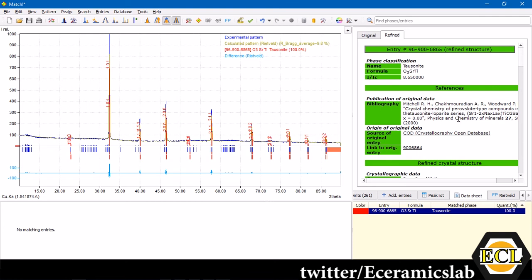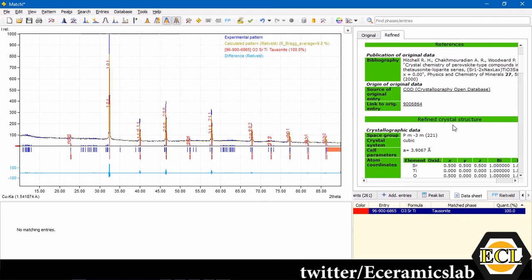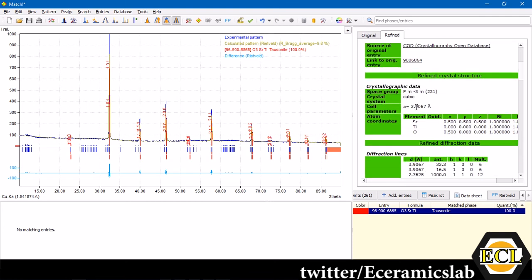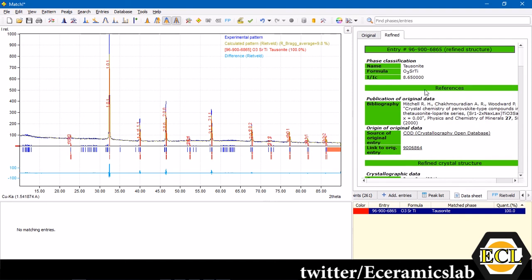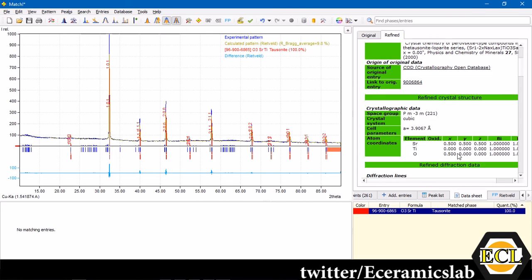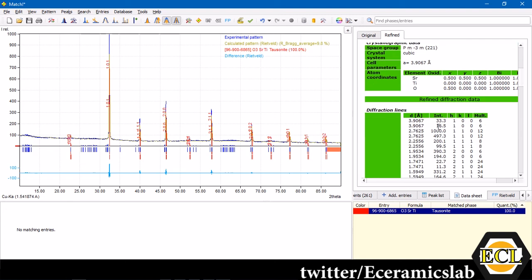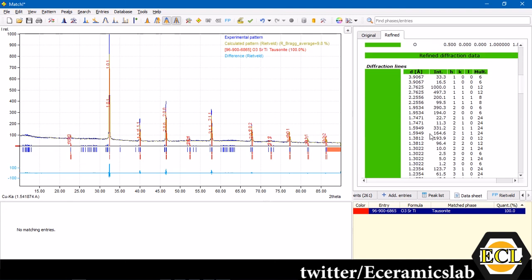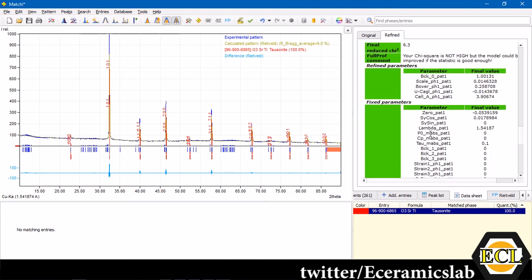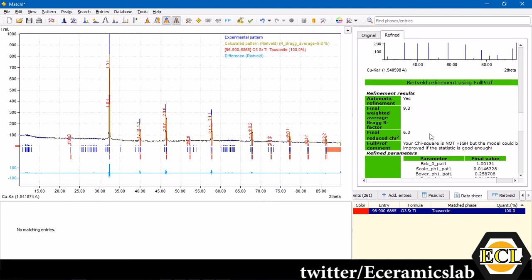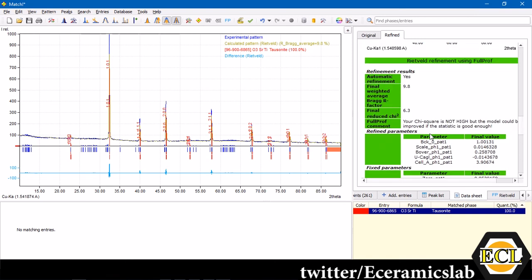In the refined data, which we have found is, it is 3.9067. Means there is a change. This change will occur because the reference file, the thermal history or the processing method for the origin file might be different than our case. So we will always find a little difference. So that is for our system. It has come out to be 3.9067. This you can report or you can compare or you can do other data analysis related with the lattice parameter.